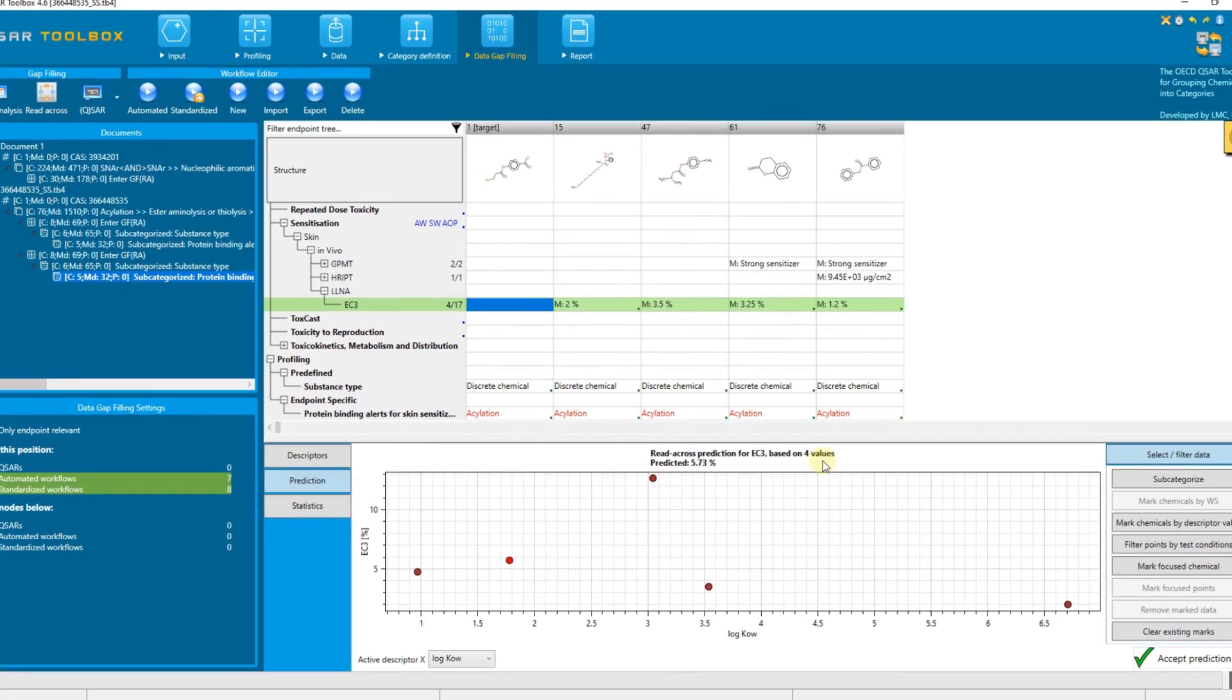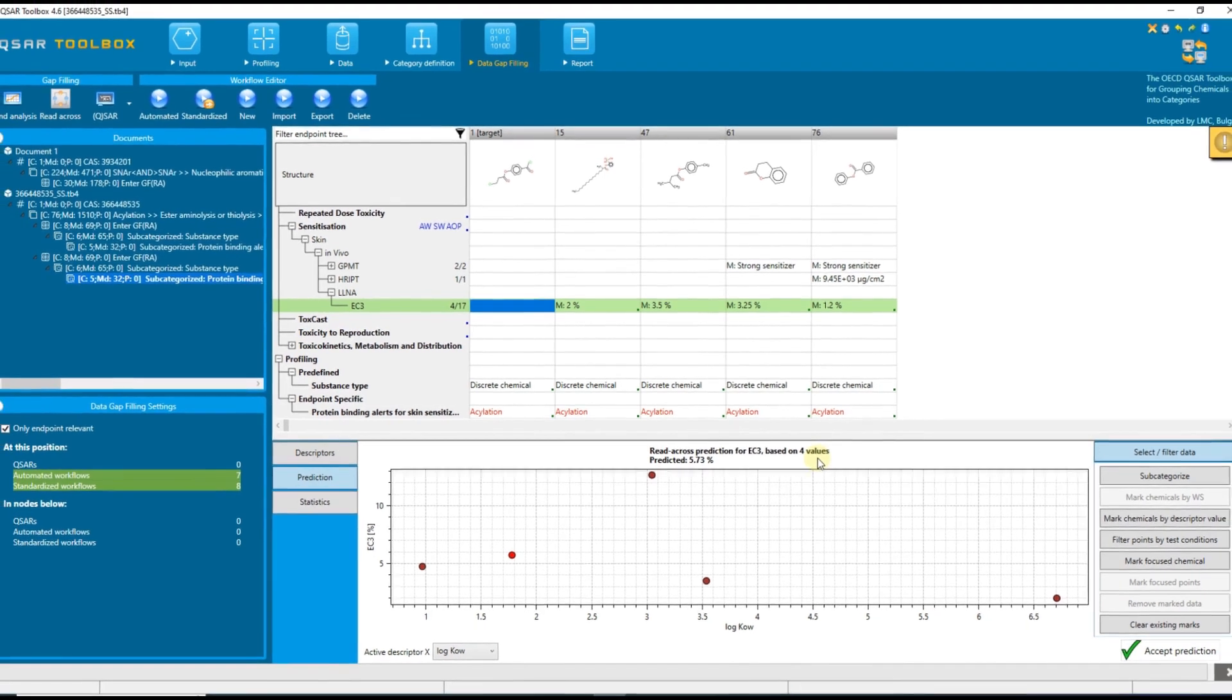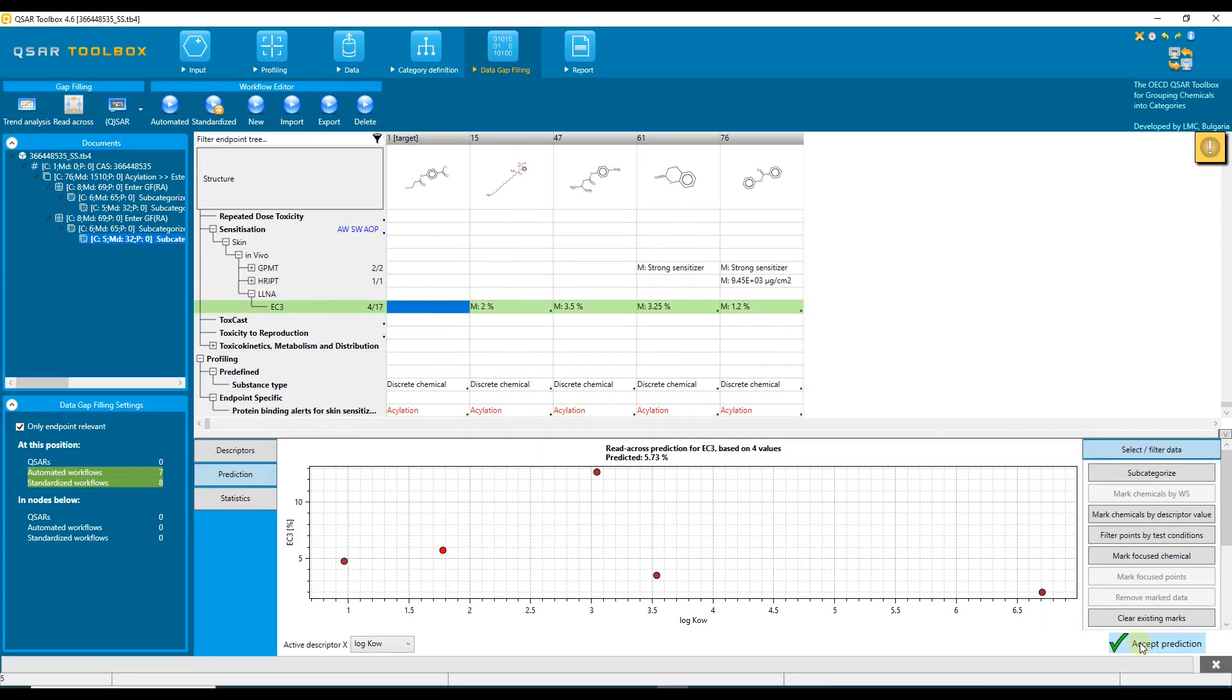Keep in mind that this tutorial was created to illustrate the subcategorization functionality in the QSAR toolbox and does not provide recommendations on how to perform an acceptable read-across under REACH. This is why essential aspects for acceptable read-across, including the quality of the underlying experimental data, availability of robust study summaries, and the impact on the toxicity of the structural differences between target and analogs are not discussed.